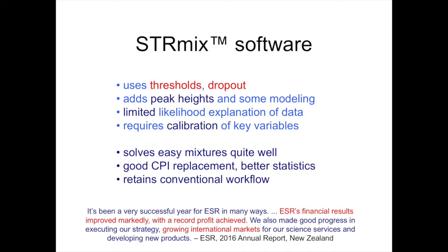There's a more recent type of software called STRmix. It comes out of New Zealand. As you'll see on the bottom, the company that makes it, ESR in New Zealand, is a commercial company. You can go on their website, and this is from their 2016 annual report, where they're pleased with the financial results of increasing profits and expanding into international markets like New York City.